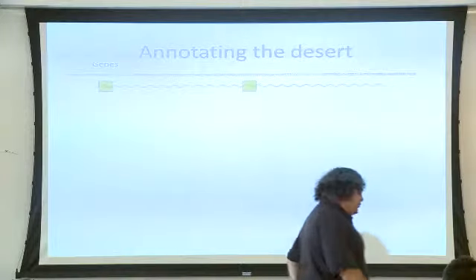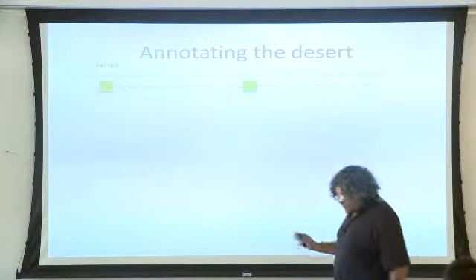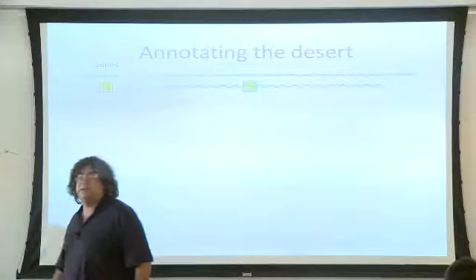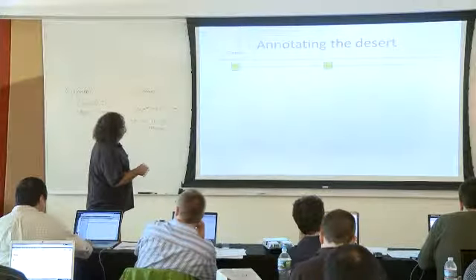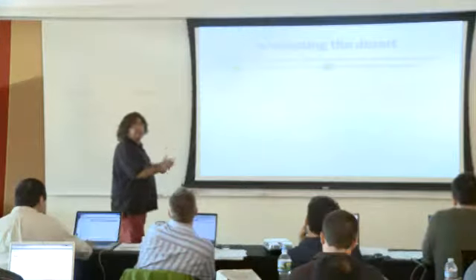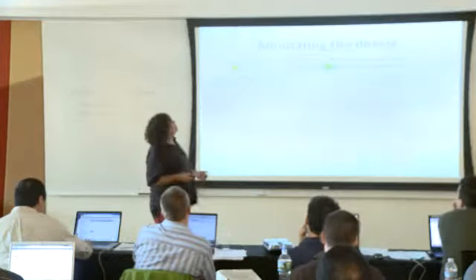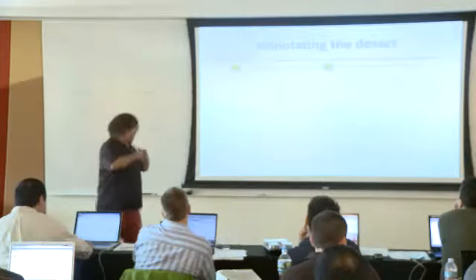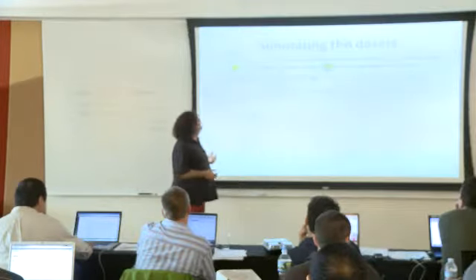Part of the ENCODE project, ENCODE is a large consortium now entering its third phase, and I'm sorry, its acronym is Encyclopedia of DNA Elements. So the goal is that we would say something about every bit of sequence here that we can. What is it doing? What's it important for? And as part of that, our group and some others did a lot of ChIP-Seq assaying and creating maps for many different cell types, many different histone modifications.